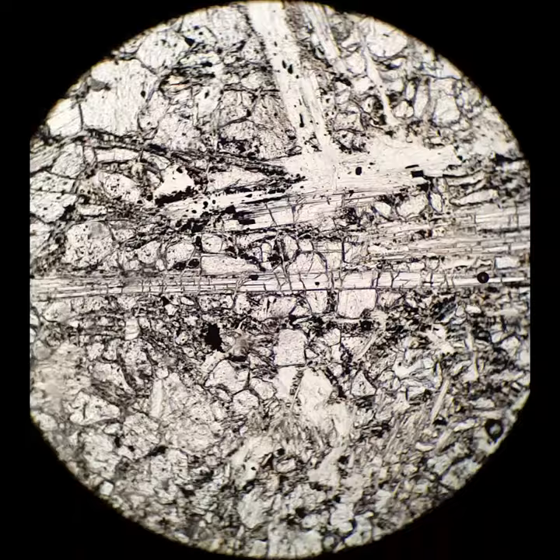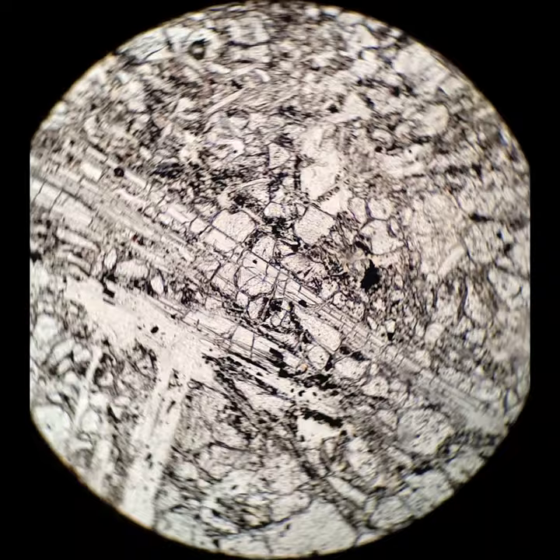This is anthophyllite. Anthophyllite is another orthoamphibole. It's colorless. You can see it's a long, skinny crystal. And when I cross the polars and it's parallel to the crosshairs, you'll see that it, too, is black.